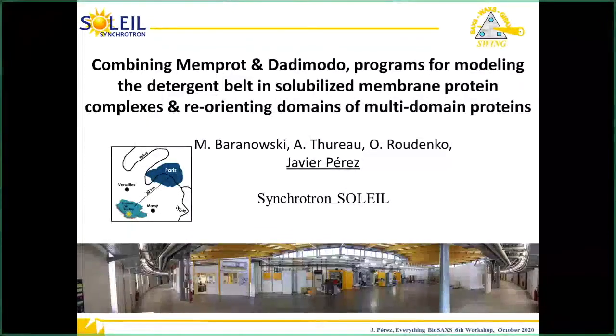And the strategy is based on the combination of two programs. One program is called Memprot, and the other program is called DADIMODO. So Memprot for membrane protein, and DADIMODO for data-directed module docking. And so these two programs combined can give an answer on how to use SAXS with membrane proteins.